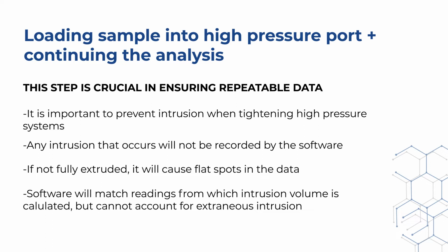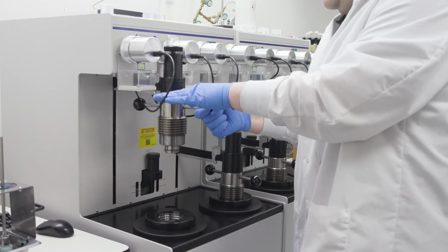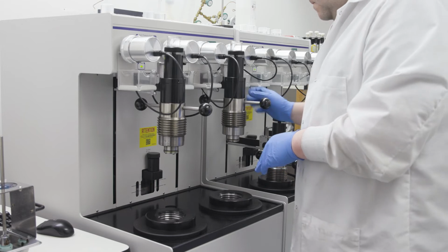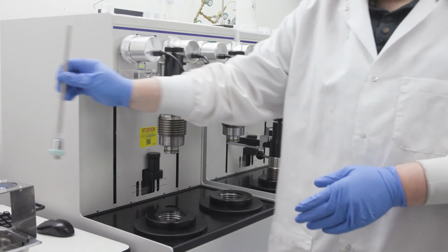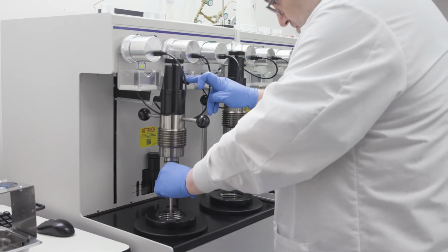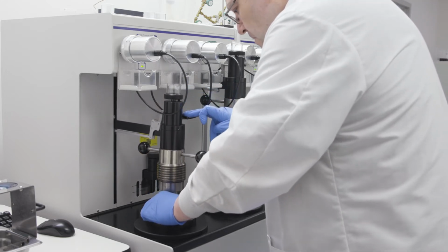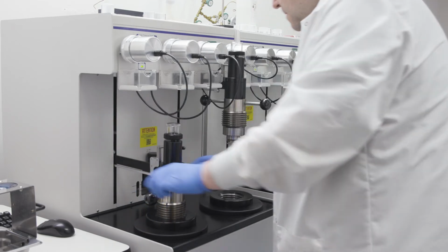The high pressure port closures are lowered at this point, but not sealed. Chris will raise the closures until the latch engages for each. He will insert the penetrometer into the high pressure port, loading it up into the closure first, releasing the latch to lower the closure slightly, and then seat the penetrometer onto the banana plug in the bottom of the chamber that connects to the high pressure capacitance. Once seated, he will slowly lower the closure until it contacts the top of the high pressure chamber.